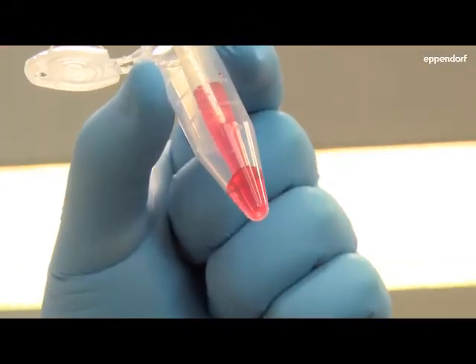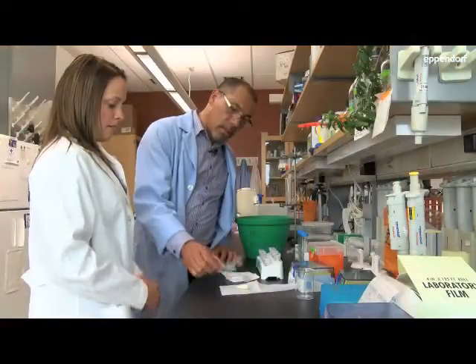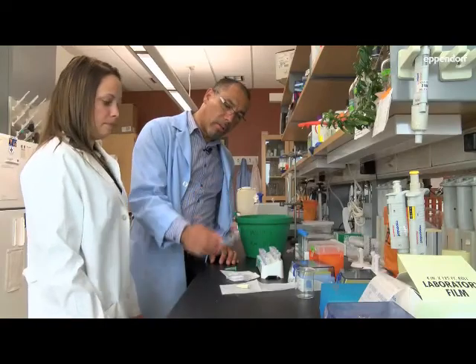Like any job, you want to make sure that when you are processing your samples you have the right tubes, the right pipettes, the right buffers — because science is already hard, so you don't need to make it any harder if you don't have the right tools to do the job.